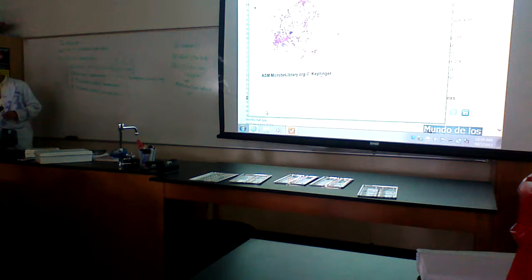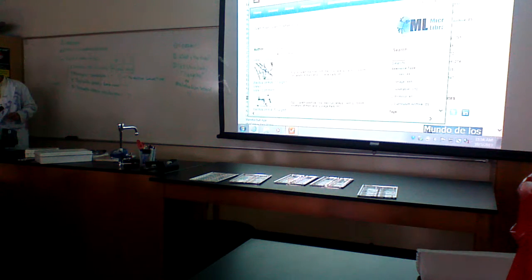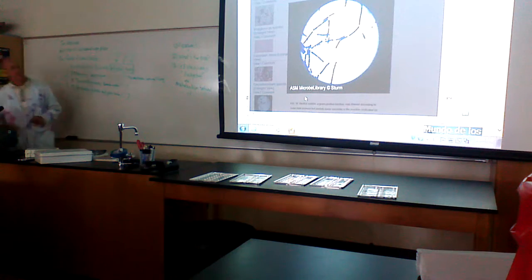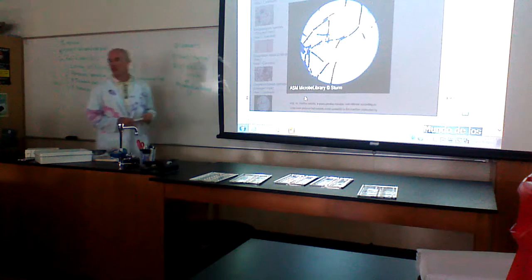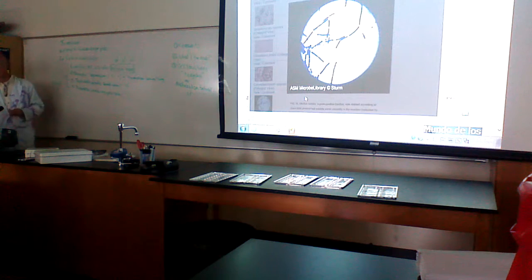Let's go back to gram stain. I'm going to talk between these two. Really, really bright. Okay. It's more pink. It's a little more pink versus this washed out pink. If it's washed out, you're not impressed. You're like, yeah, I can see it, but I'm not going to spend $30,000 to buy a boat that looks like that. That's gram stain.